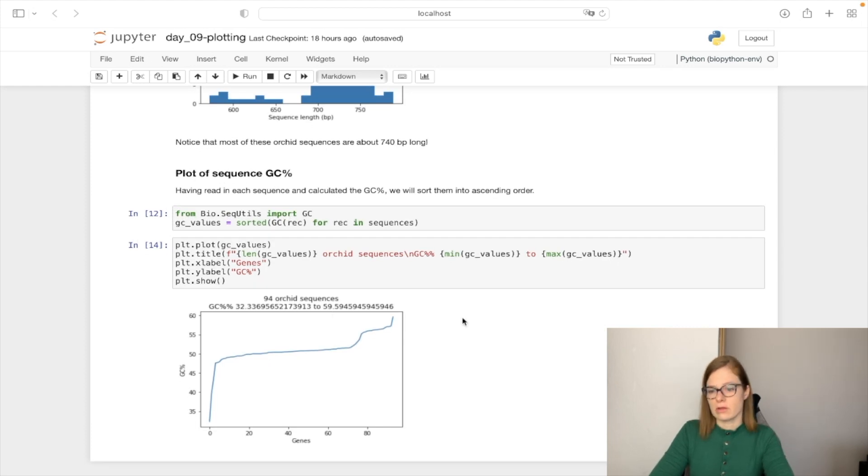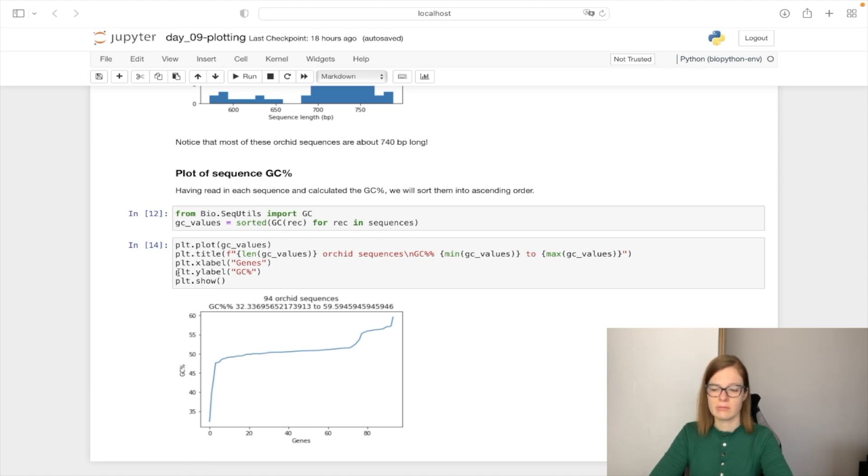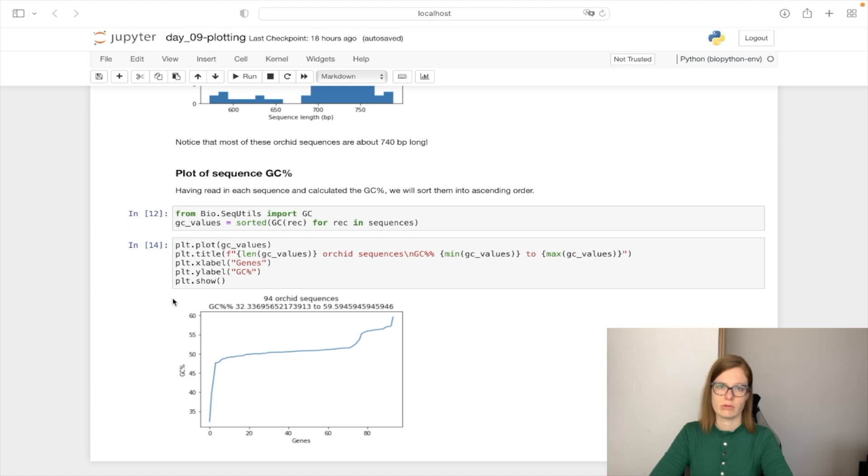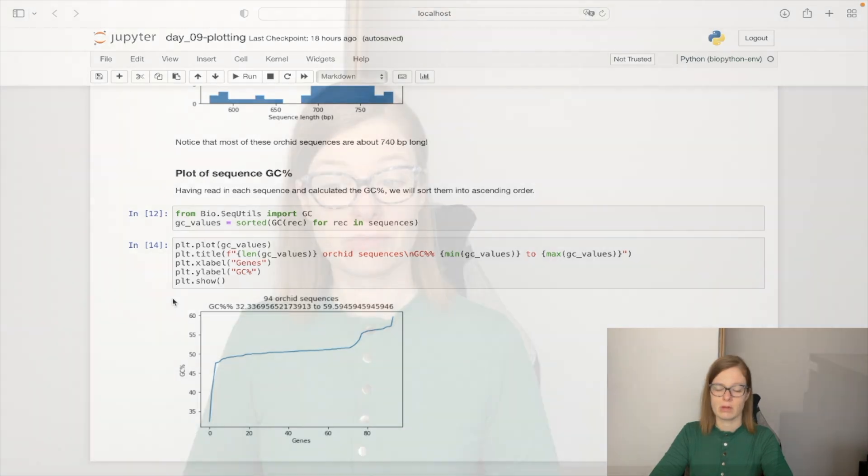So those were two plots done on the content of the FASTA files. With a similar approach and same library, you can plot your own plots.